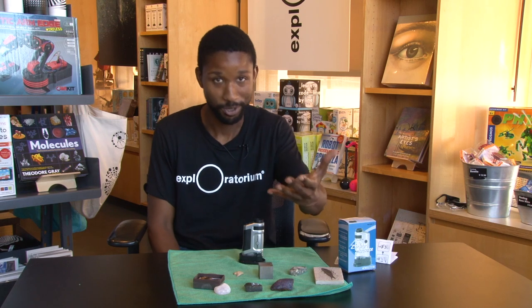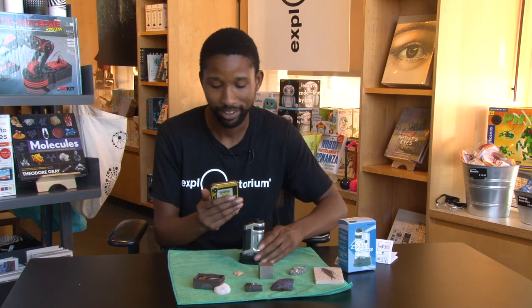Another cool trick you can do with this microscope is use your phone to take videos or pictures of things you're looking at. Let's go ahead and take a look.